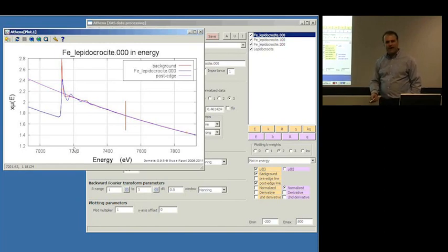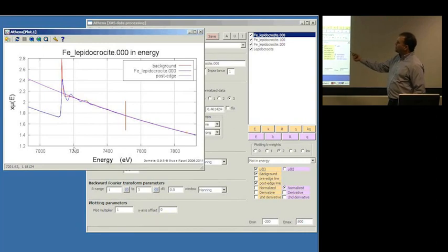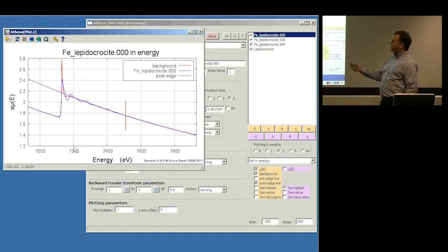So the point Gian Antonio is making is that there's an ambiguity in the processing of the data, because our criterion for choosing the purple line, part of our criterion for choosing this number, is defined way out here, not right up here. But this number is determined right up here. So you have an inherently difficult chore of making the choice of these purple lines consistent across an ensemble of data that might have a varying white line height.